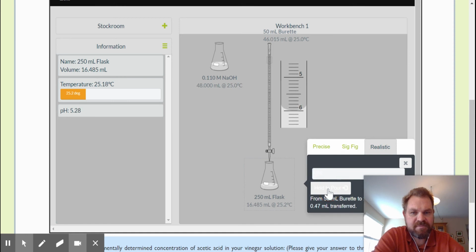We're at 6. And it doesn't look like it's quite turning pink yet. Maybe it's turning. Let's see. Close. The pH is also something to keep an eye on. Looks like that's going to start going up rapidly here now.